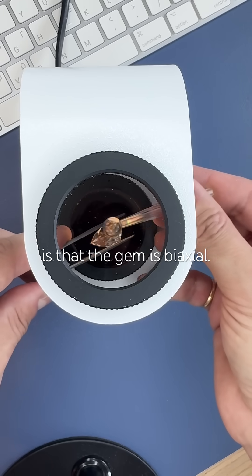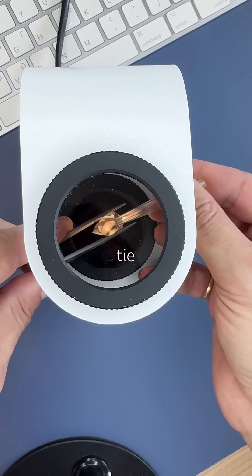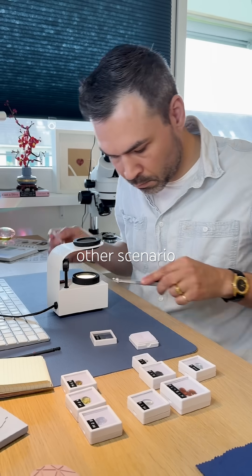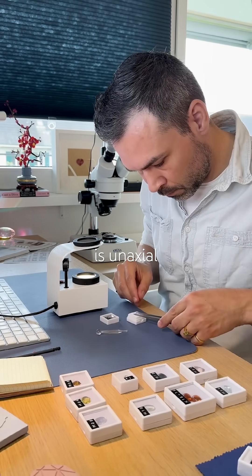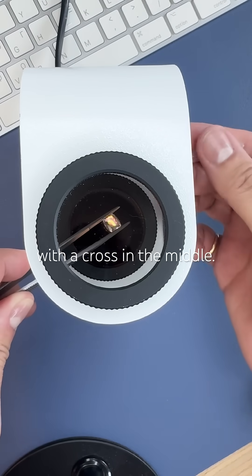One scenario is that the gem is biaxial — it usually looks like a white bow tie or two curved dark bands. The other scenario is that the gem is uniaxial, and then it looks more like a target: concentric circles with a cross in the middle.